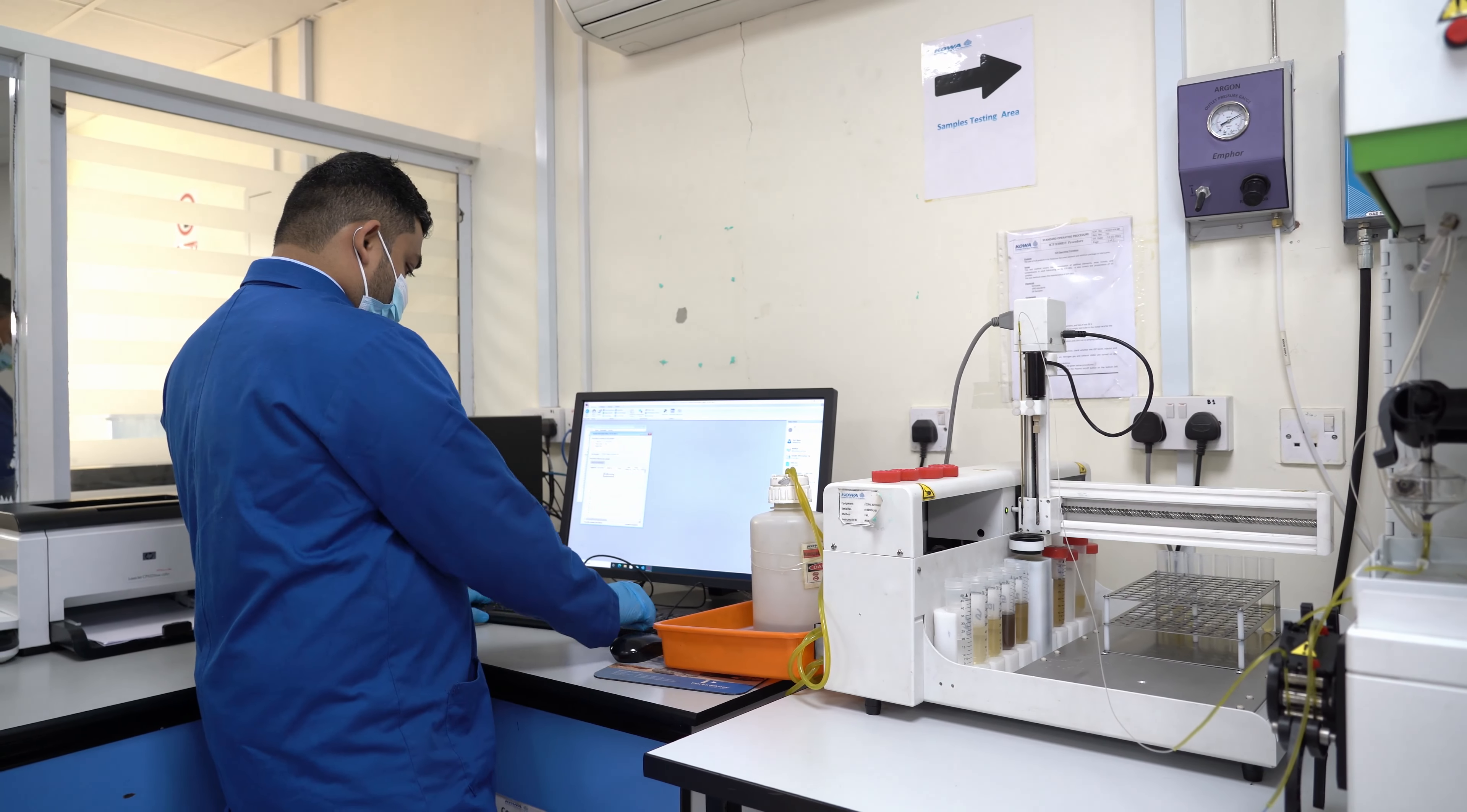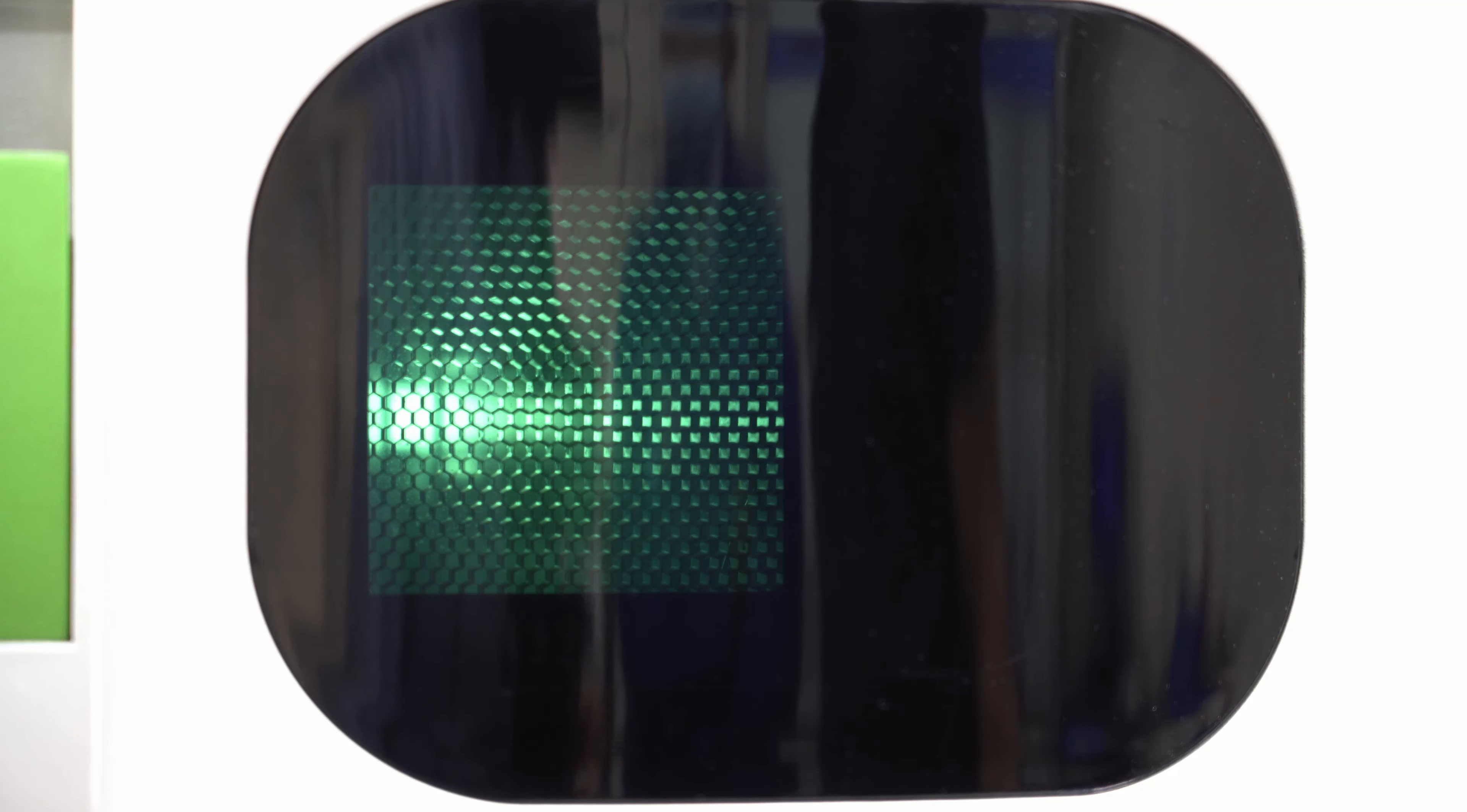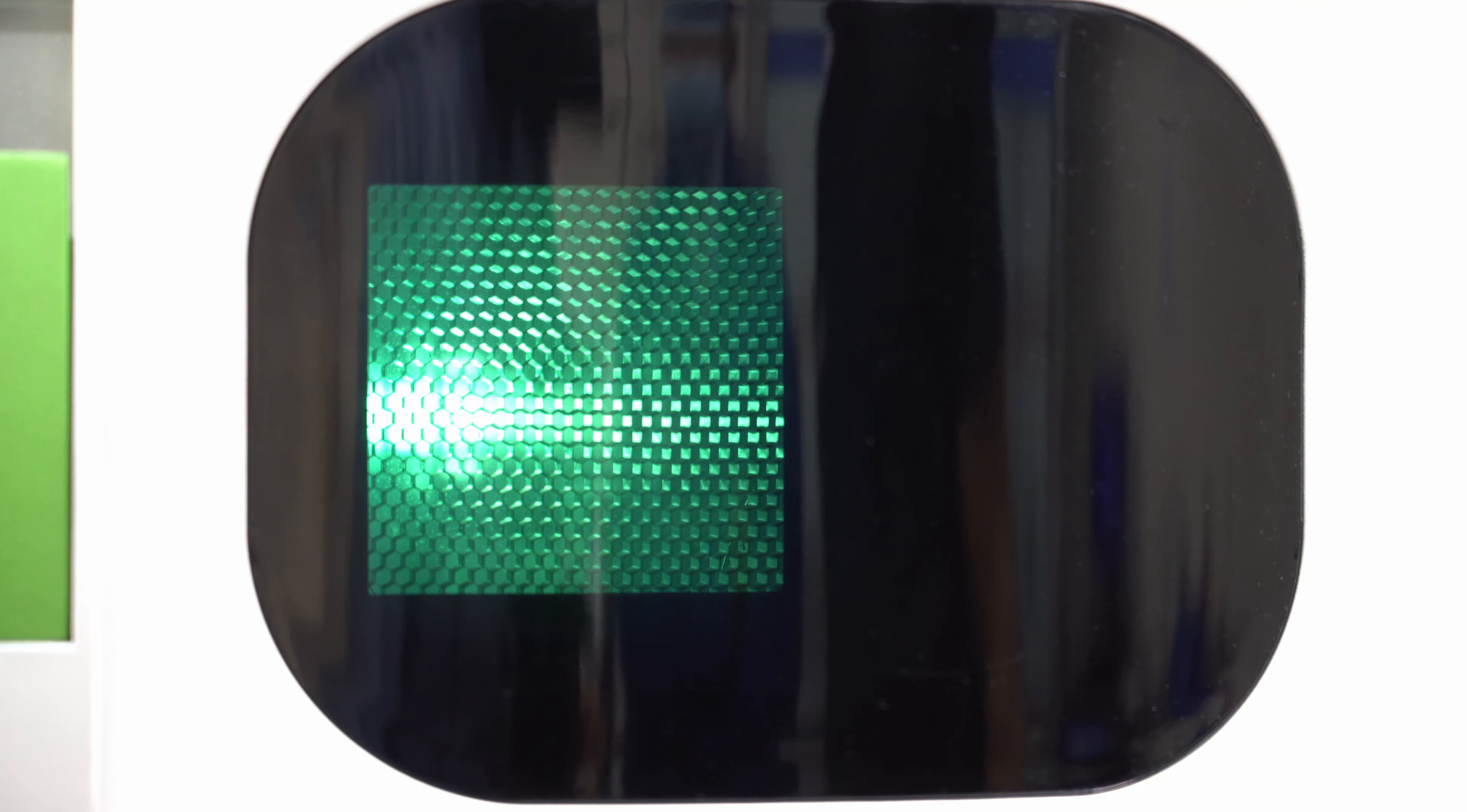The solvent diluted oil sample is introduced to the plasma torch in the form of aerosol with plasma temperature in the range of 6,000 to 10,000 degrees Celsius.